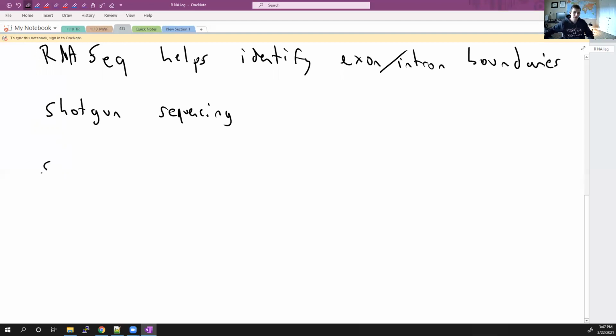However, recognize whenever I say sequences, this can be translated into reads. So I may say reads a lot, but really that's going to translate into sequences. I'm going to say these two things kind of interchangeably. So recognize whenever I say reads, I'm referring to unique sequences.